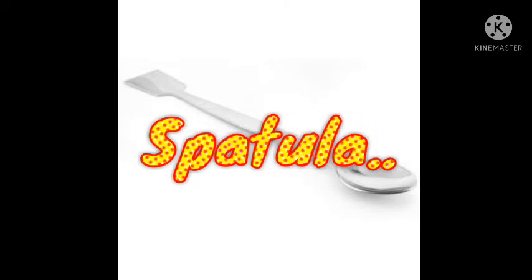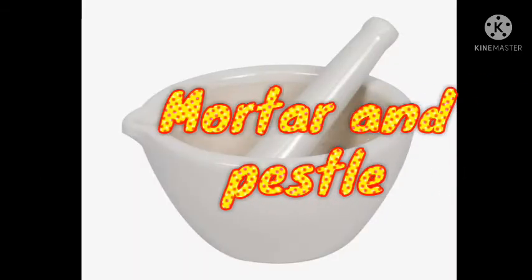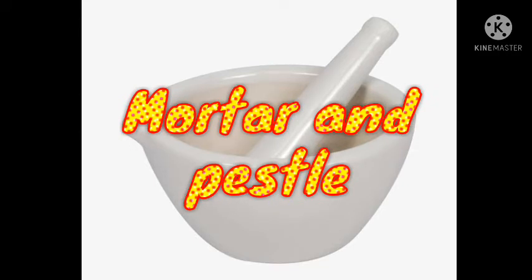The next material is known as the spatula. It is used to mix, spread, and lift materials or substances during an experiment. Next, we have mortar and pestle. They are usually used to smash some ingredients during an experiment and also to grind granular substances into powder.